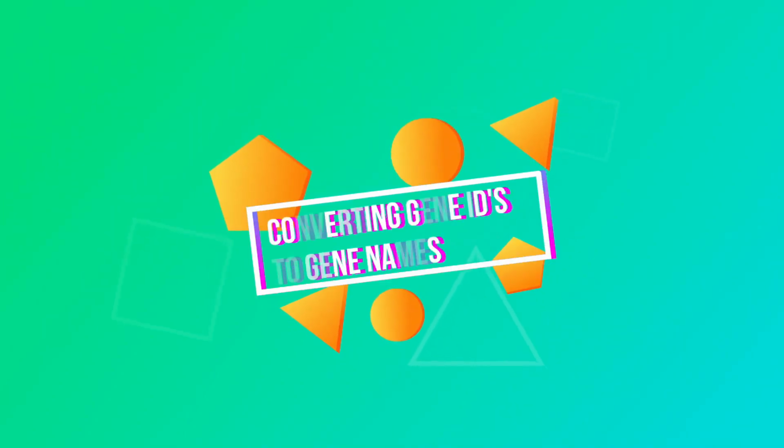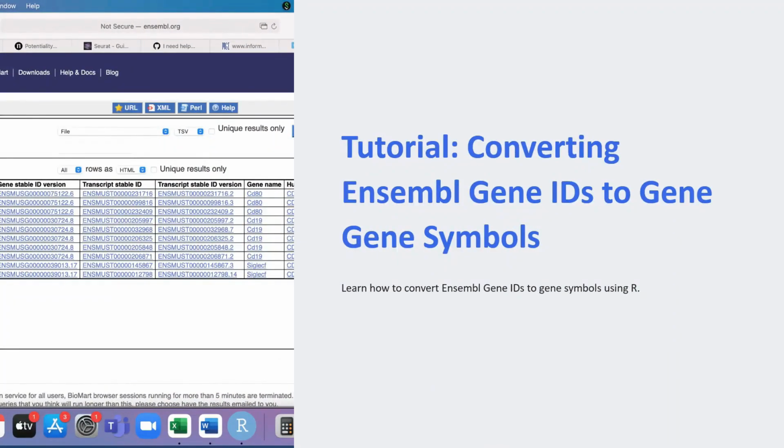So let's talk about converting the Ensembl gene IDs to gene symbols. Ensembl gene IDs are the unique identifiers assigned to the genes in the Ensembl database. However, gene symbols, also known as gene names, are more common than Ensembl IDs for referring to a gene. So why is it important to convert our Ensembl gene IDs to gene symbols?